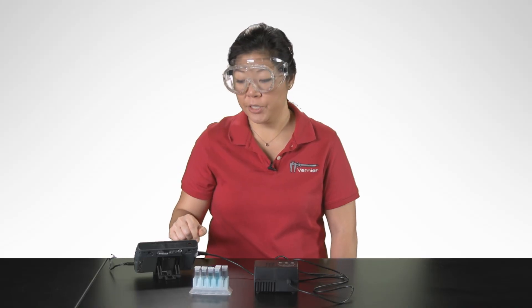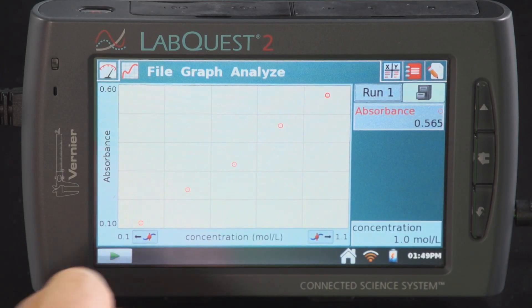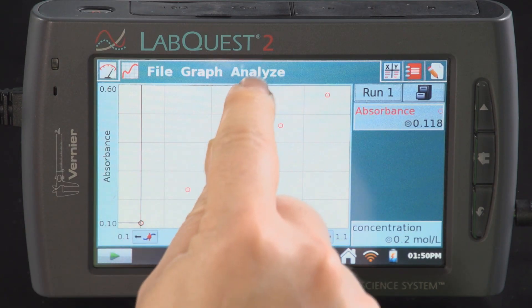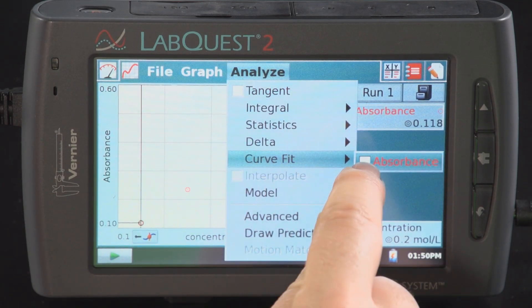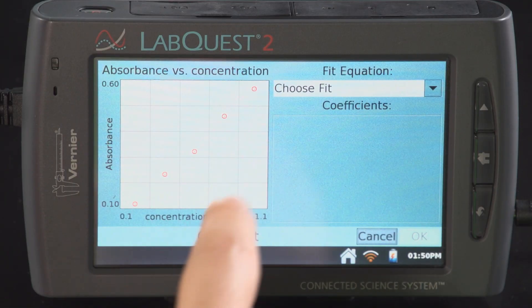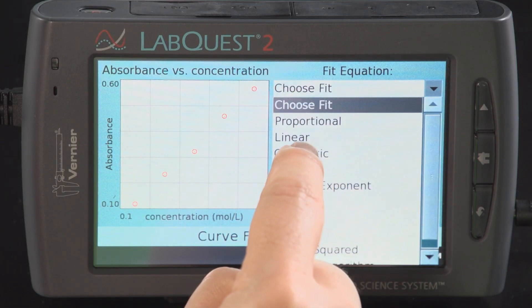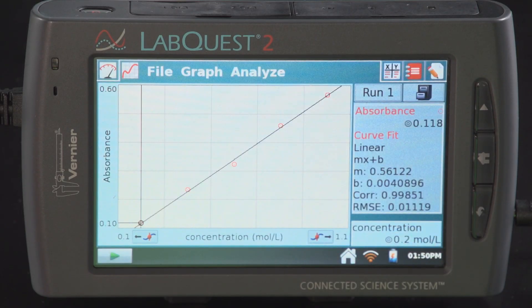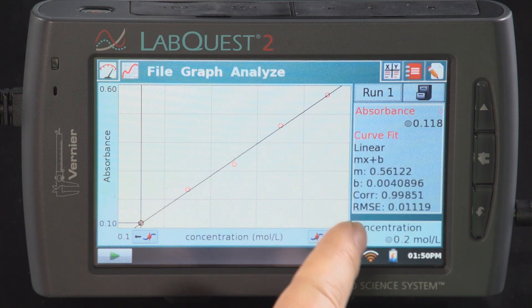When you have finished, tap on the stop button. To analyze the data, begin with the linear fit. Tap on analyze and choose curve fit. Under choose fit, tap linear. The best fit linear regression line is displayed on the right, showing the slope and the y-intercept.